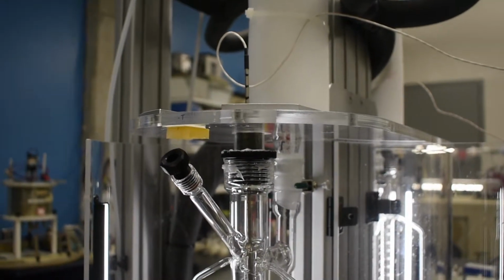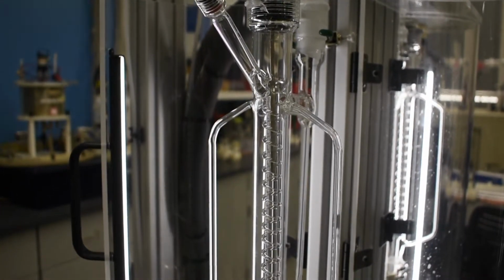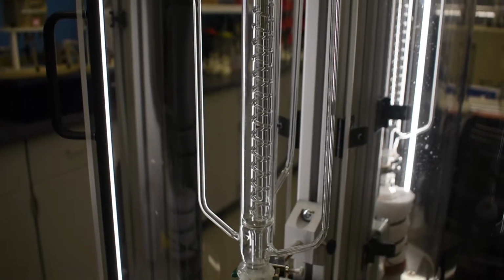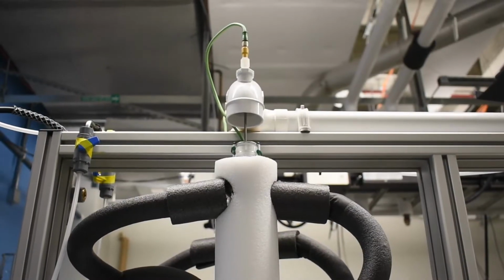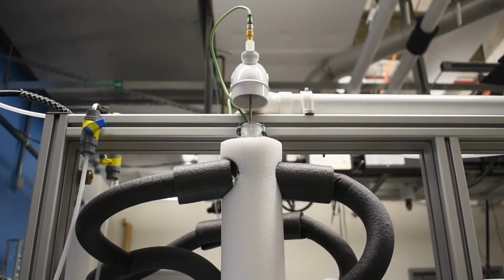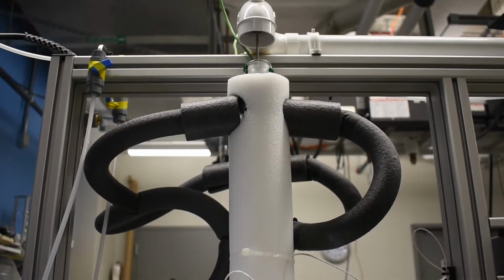In this lab experiment, you will be working with 4 ebulliometers that will run simultaneously to collect data for the different solute-solvent combinations. Ebulliometers are instruments that have been designed specifically to accurately measure the boiling point of liquids by measuring the temperature of vapor-liquid equilibrium. The system is open to the atmosphere through the condenser so that operation will be run at constant pressure. In the condenser, the vapor fractions that rise up are condensed to prevent mass loss. The condensate will eventually return back to the boiler.